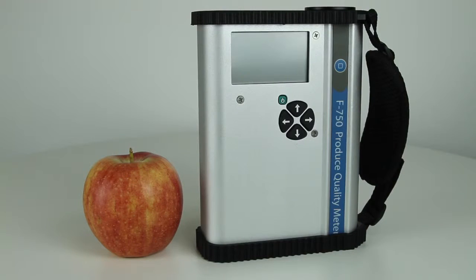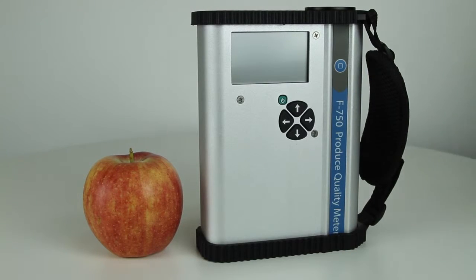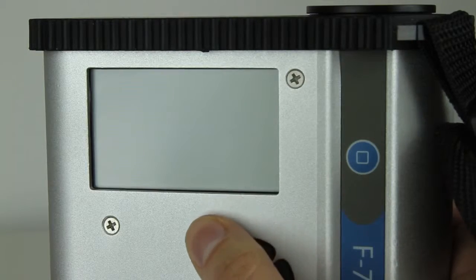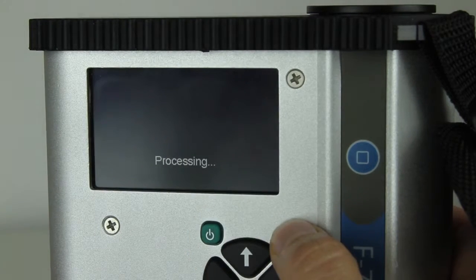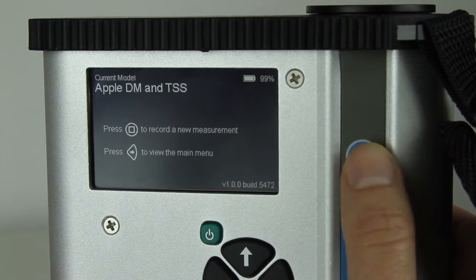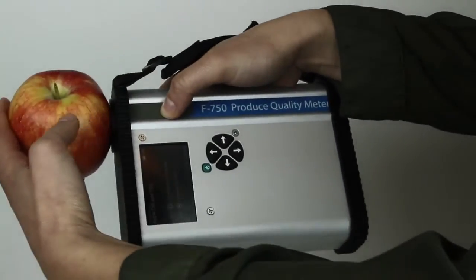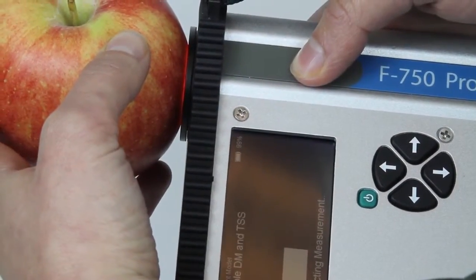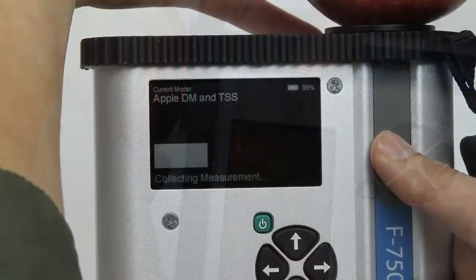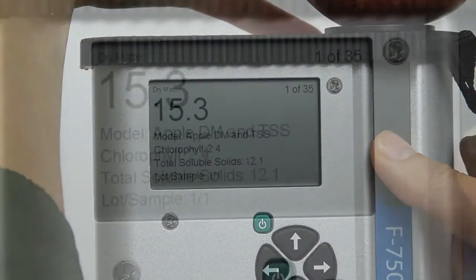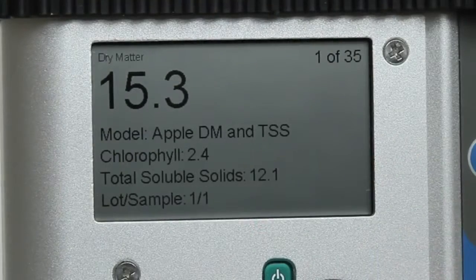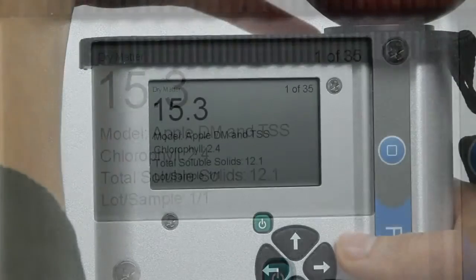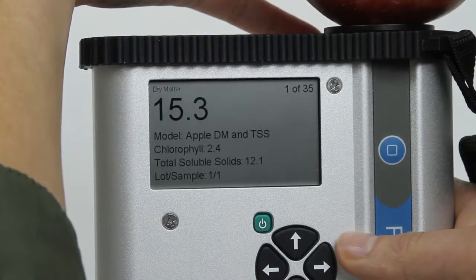The F750 Produce Quality Meter is a portable and lightweight tool that delivers non-destructive quantitative measurements of substances such as chlorophyll, features that involve multiple substances such as ripeness, brix, dry matter, or total soluble solids, as well as qualitative metrics such as flavor and personal preference.